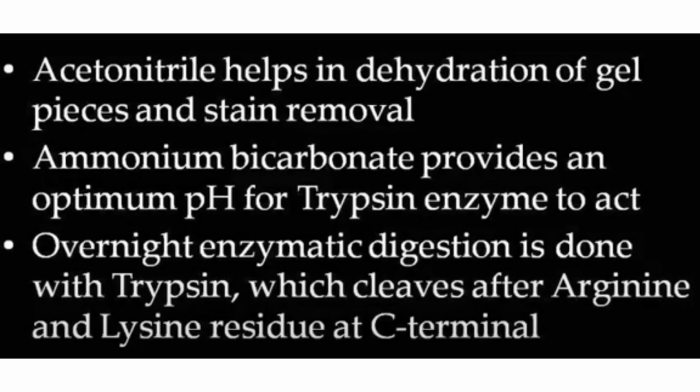Then, depending upon your method, a specific amount of protein is added to the mass spec plate, or else the MALDI plate, after doing MALDI preparation, like adding it into the matrix, etc., and then loading onto the plate. So acetonitrile basically helps in dehydration of the gel and also helps in stain removal.